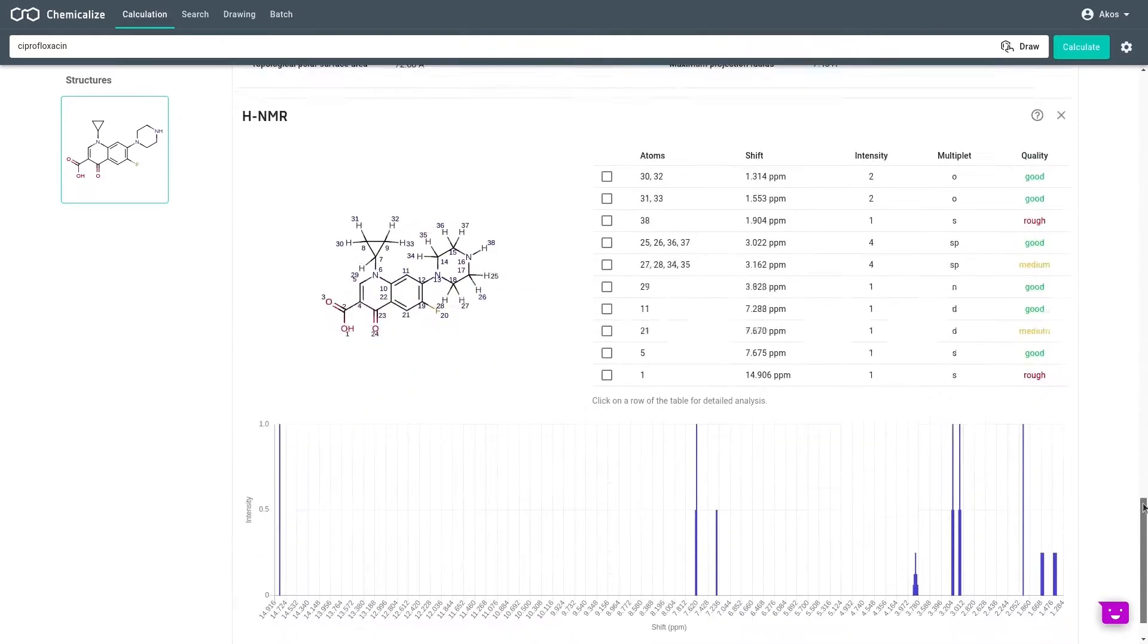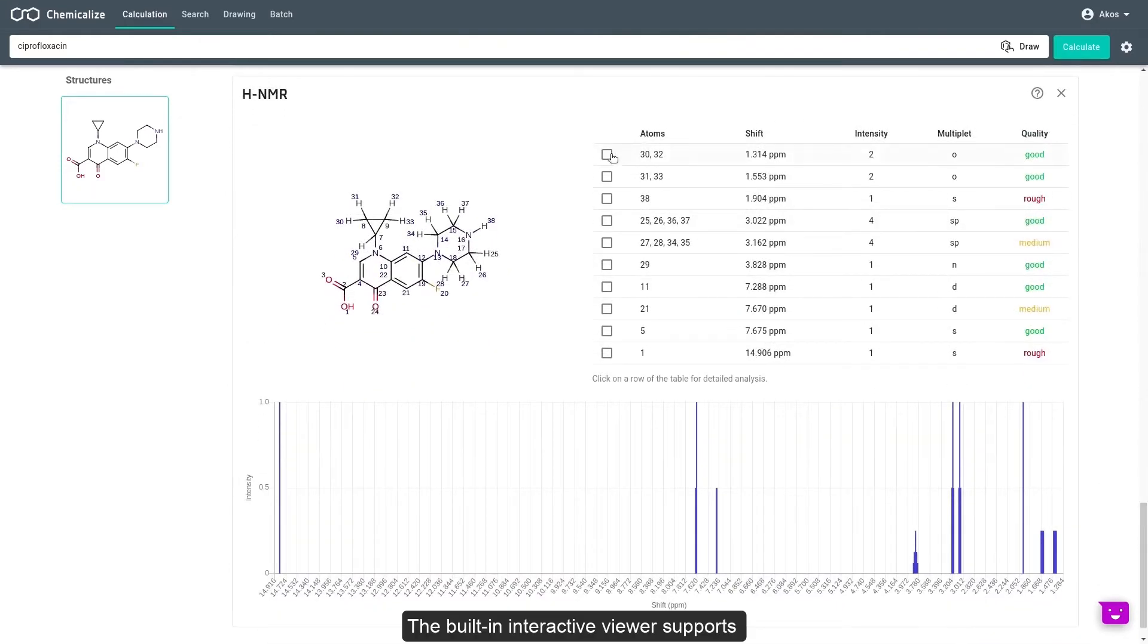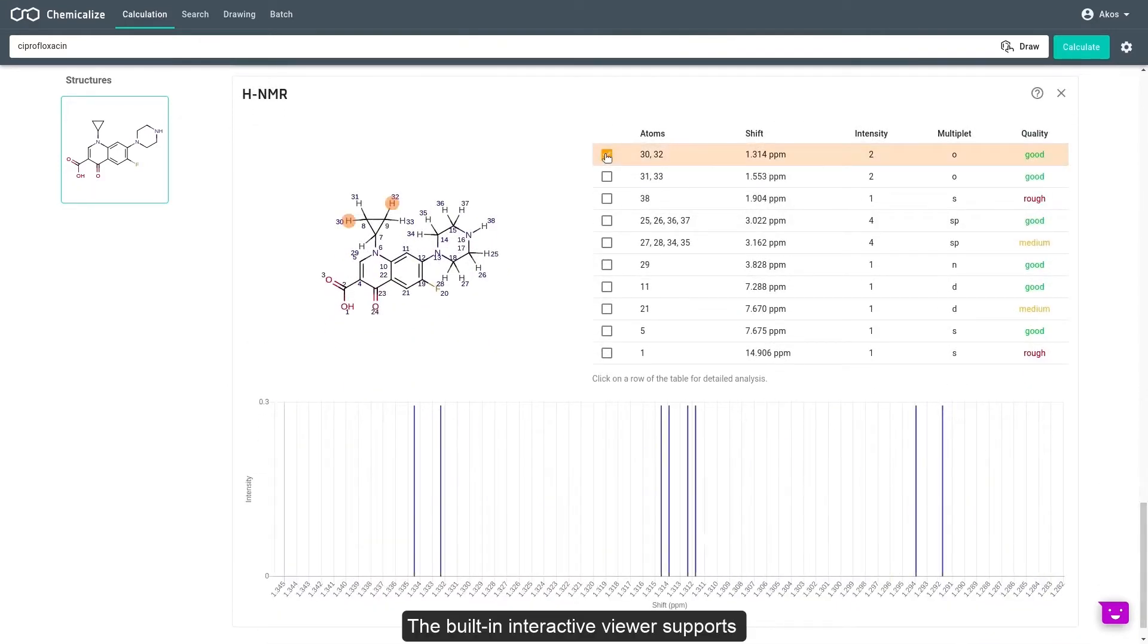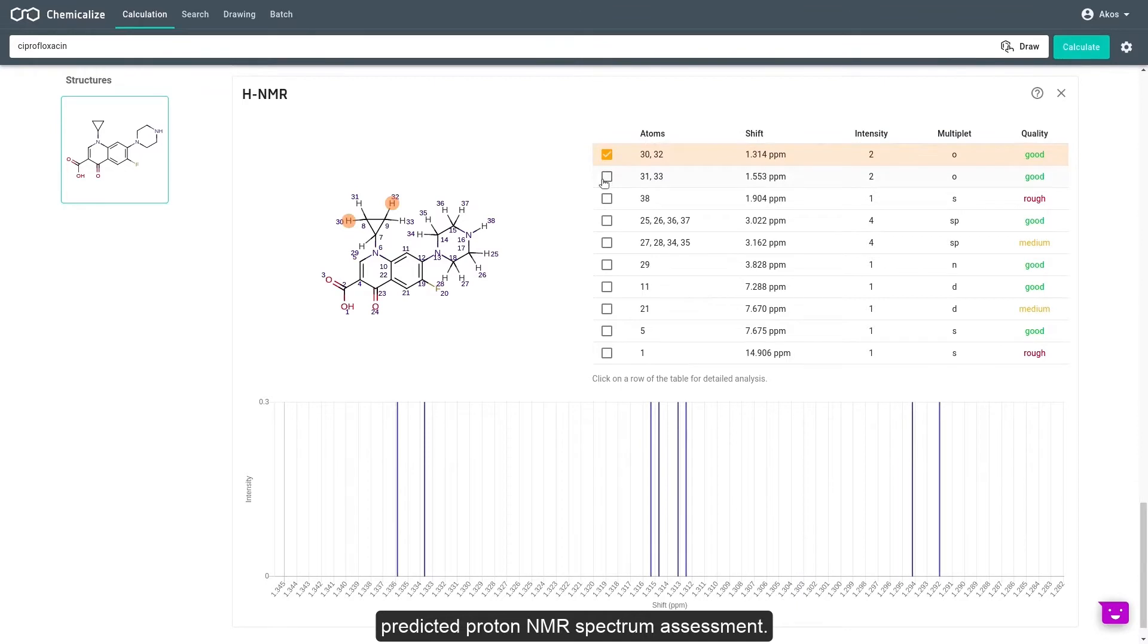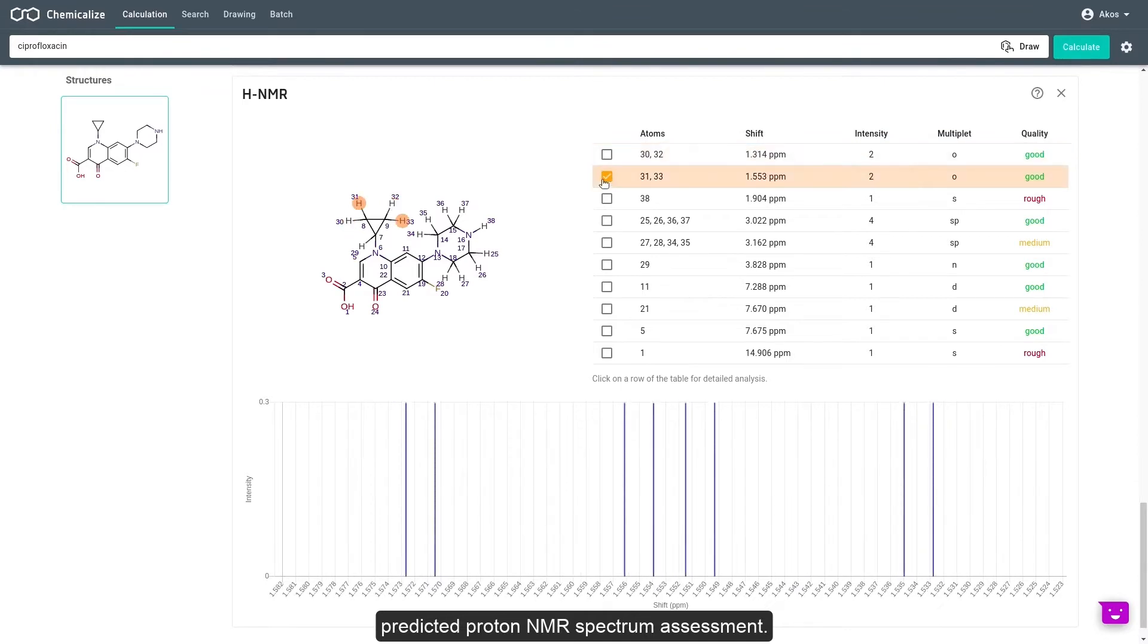The built-in interactive viewer supports predicted proton NMR spectrum assessment.